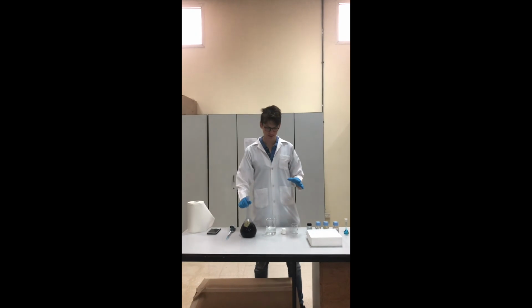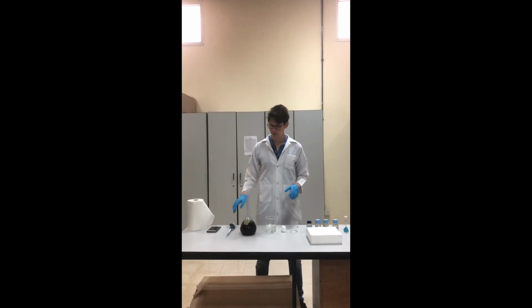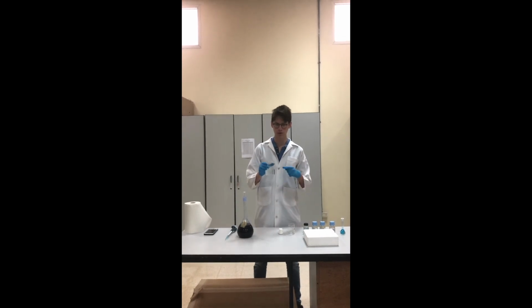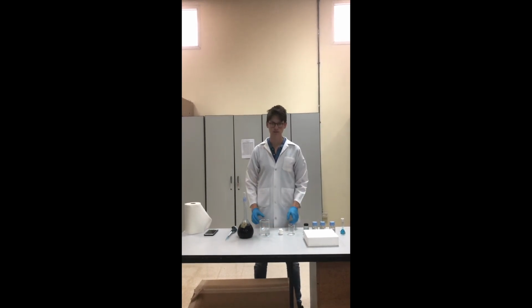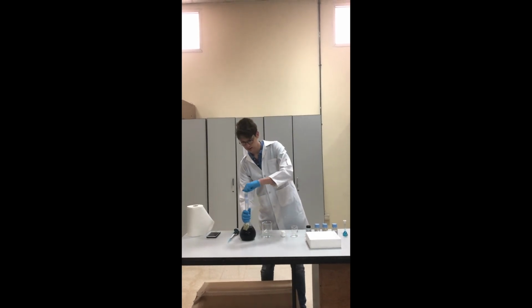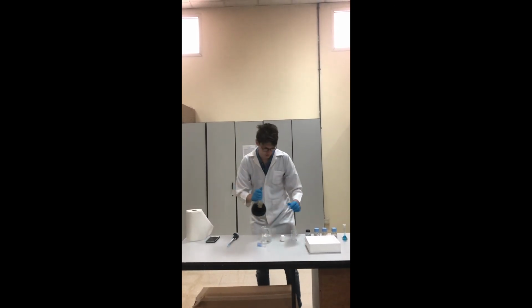What we're going to do now is prepare the samples. For that, we need a pipette, 200 milliliters of room temperature water, gauzes, and a small beaker. What we're going to do now is add some stock solution into the beaker.